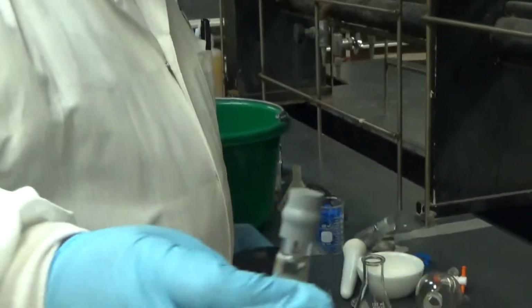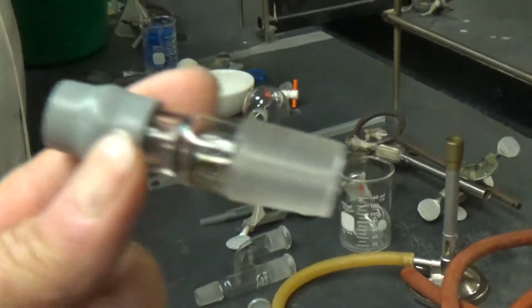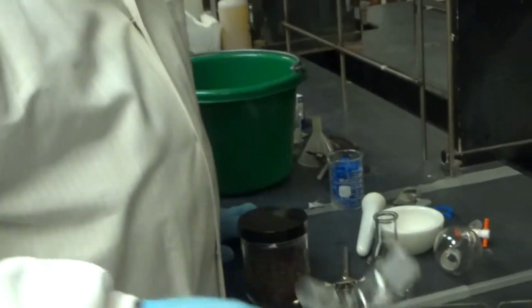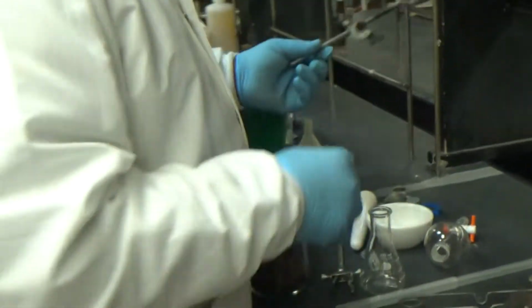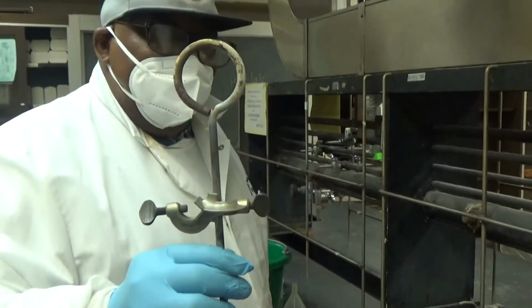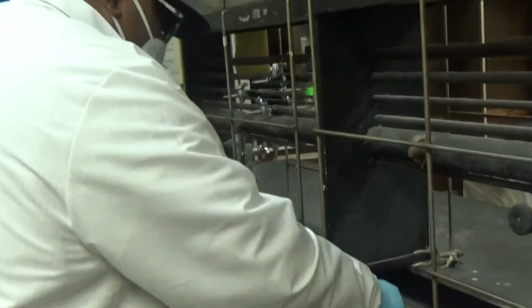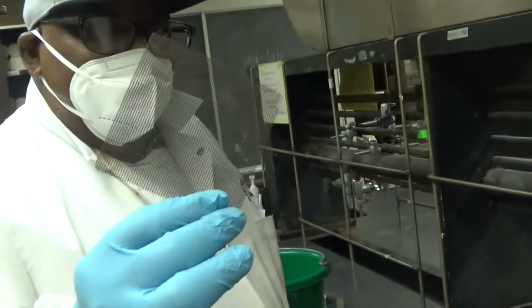We'll need a thermometer adapter. Thermometer adapter. The distilling head. Distilling head. So you are going to need a metal O-ring. Metal O-ring. For that you need a wire mesh. Wire mesh.